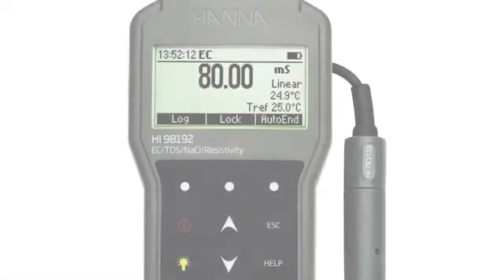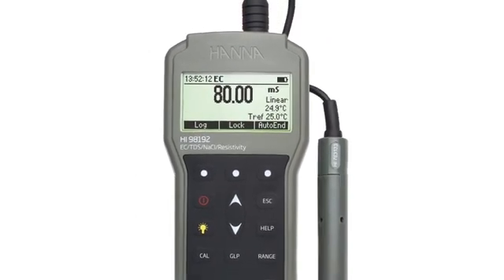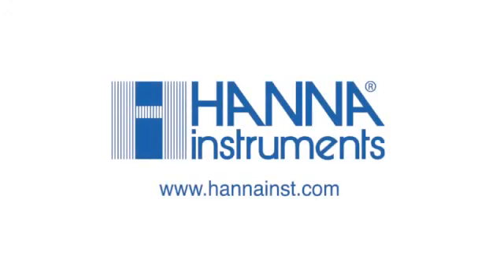The HI-98192 is an excellent choice for the customer who is looking for a rugged, waterproof meter that encompasses the features of benchtop instrumentation with the convenience of a portable meter. For more information about this or any of our other products, please visit our website.